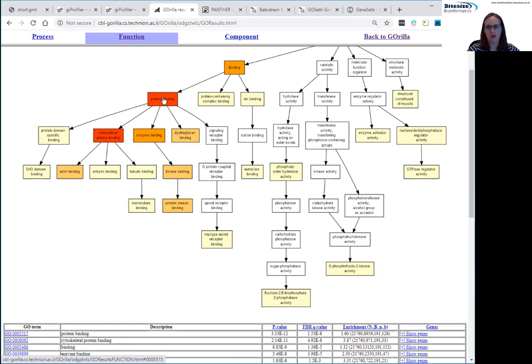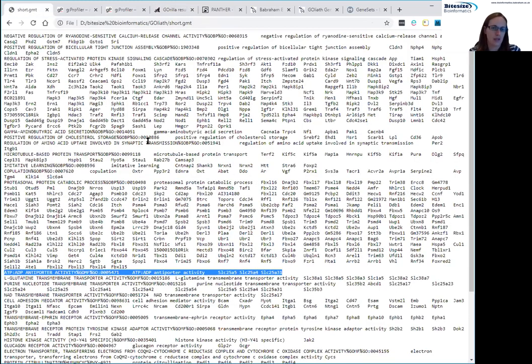So if half the genes in the genome are in a category, then it's not particularly going to tell us very much about our set of genes there. So most useful sets biologically are probably not going to be those that are at these extremes. They'll be the ones that have more than a handful of genes, but not thousands.